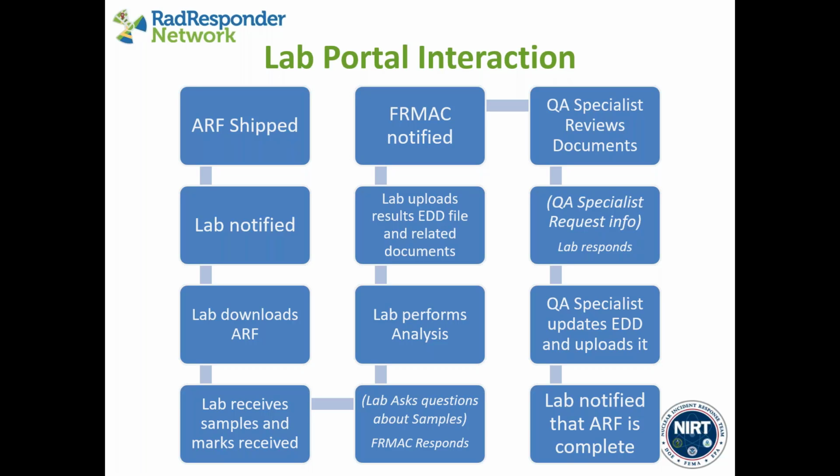Then once the lab performs their analysis and creates their result files and their electronic data deliverable files in the RadResponder data reporting format, they'll post those files to their portal. Then we have the option of having a QA specialist, or someone tasked with reviewing this lab data, go in, download those files, take a look at them, and make sure the EDD is filled out correctly and ready to upload.